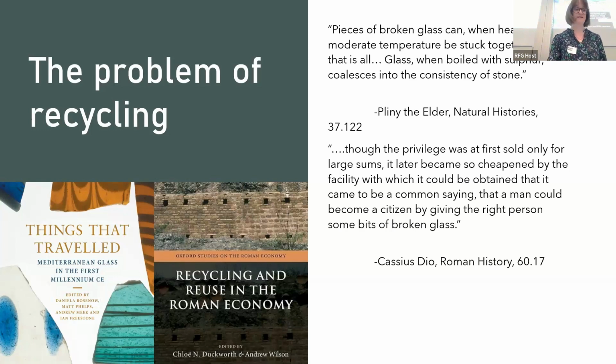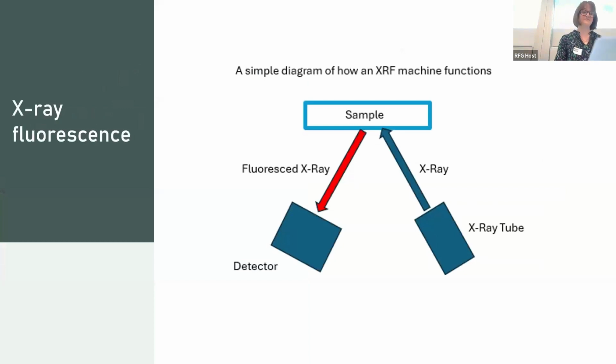And with that, we better go back to our chemistry lesson. So I hope you like diagrams. Not to assume knowledge, but as XRF is fairly commonly used now, especially with more frequent use of handheld XRF in museum and cultural heritage contexts, I'll provide a relatively whistle-stop explanation.